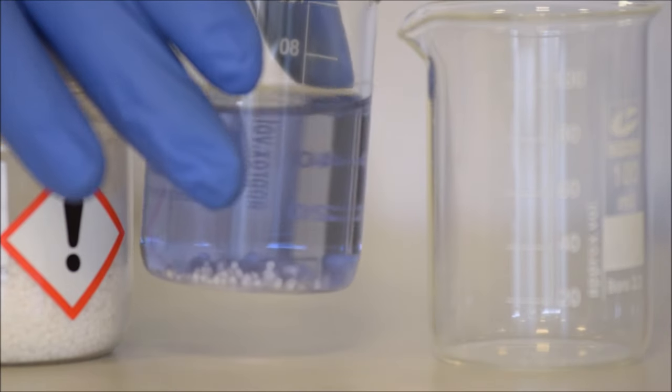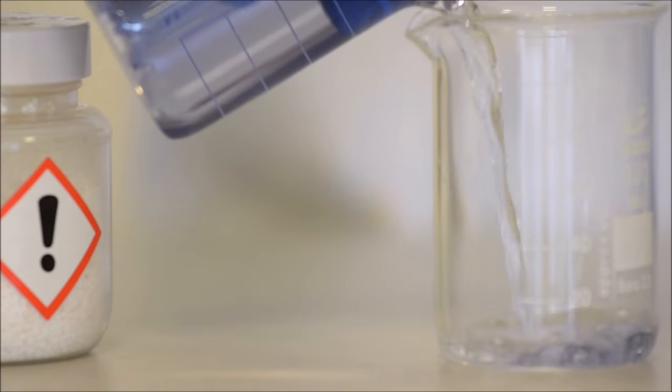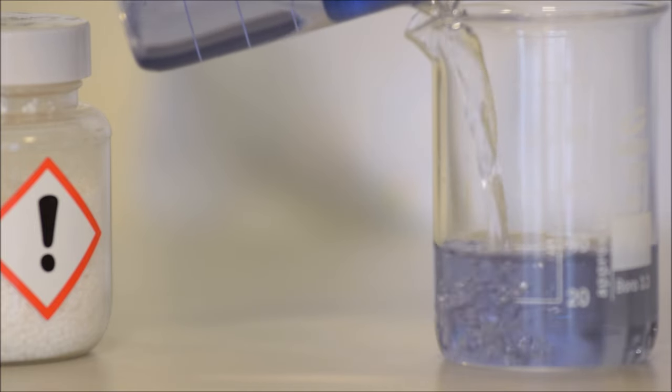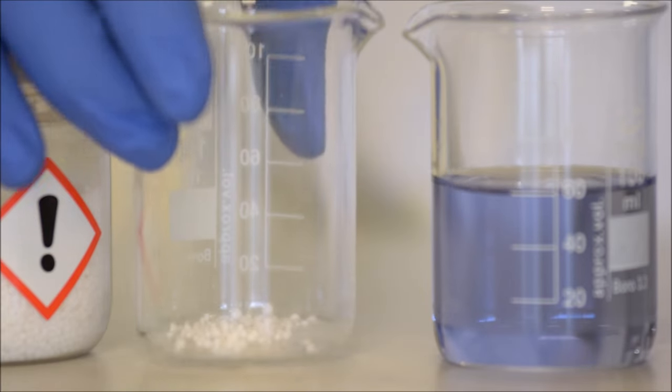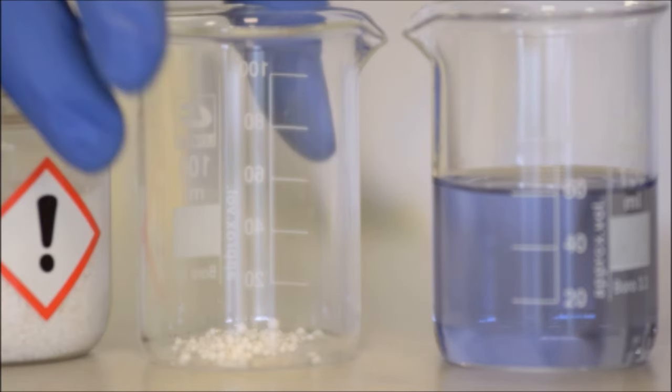We take our beaker with the solvent and the solids at the bottom and just carefully pour it out, leaving the solids behind. And that way we now have our organic solvent with no water, and we can evaporate off our organic solvent to give us back whatever we had dissolved in it without any problems with additional water.